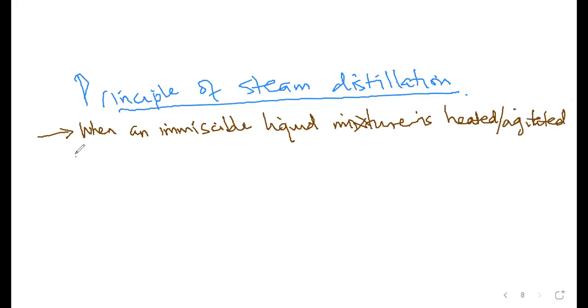Teacher, I thought you wanted to describe, to list down the principles. People call them principles, but it's one principle that you're explaining, although people confuse them by calling them principles. They can tell you to explain the principle of steam distillation. You're not outlining, but you're explaining.